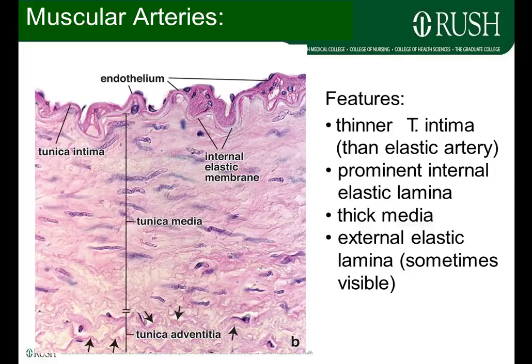Those smooth muscle cells, remember we talked about those in our last unit, and I said when they're contracted they often look corkscrew. So that's a very common appearance of the smooth muscle cells in the tunica media, which are circularly oriented around the lumen.